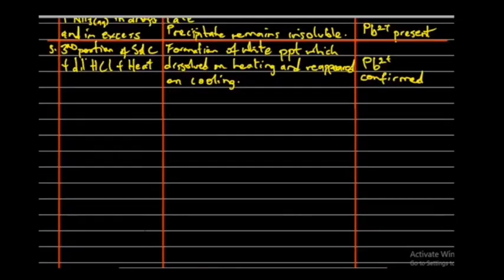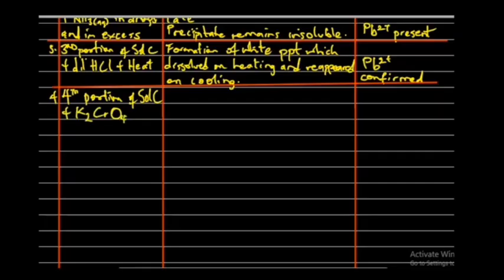So to the fourth portion of solution C, we added potassium chromate.